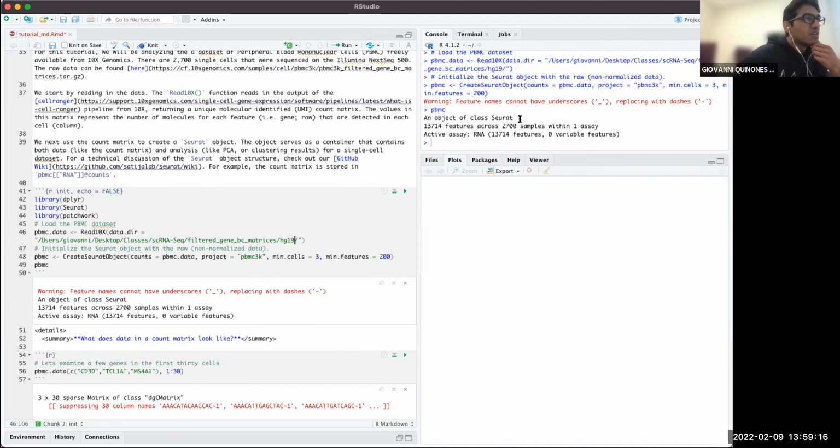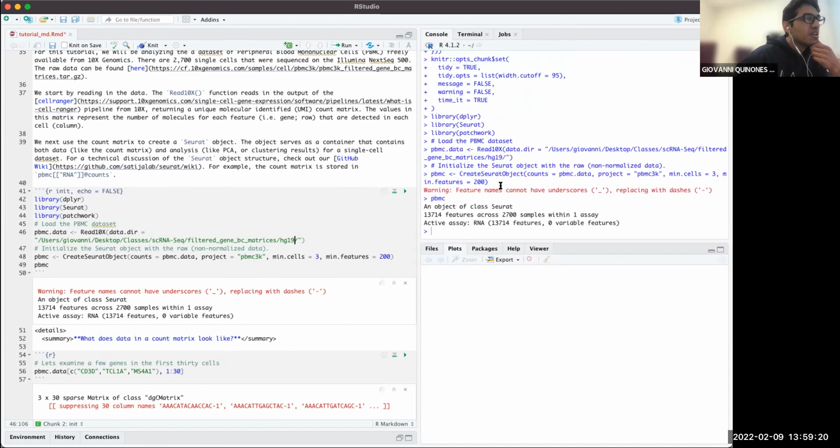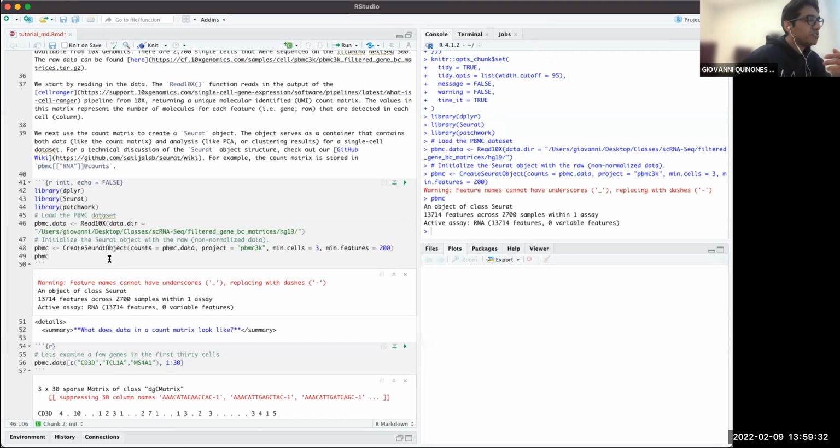And here on the top right, I have the console, where we can see the output of the code that we're running. But because this is a notebook, if we generate a plot or print something, we're also going to see the output right underneath the cell.